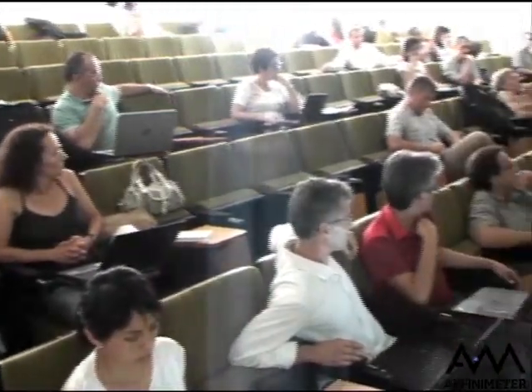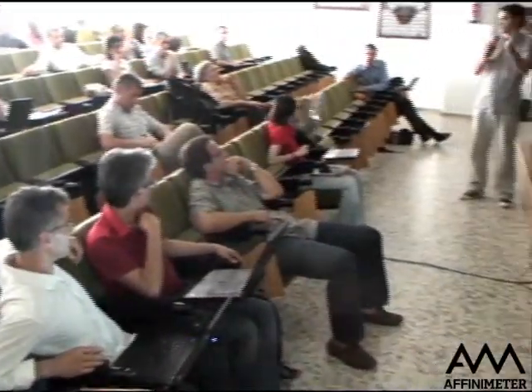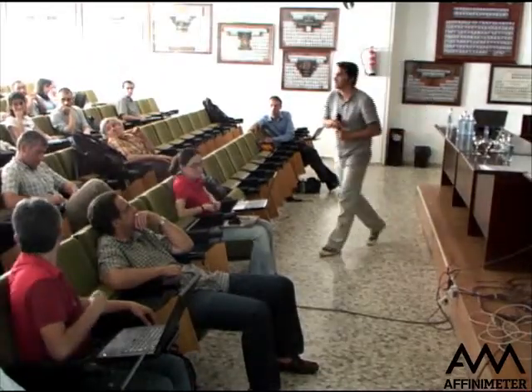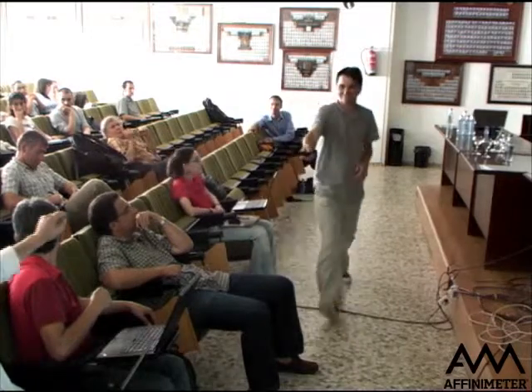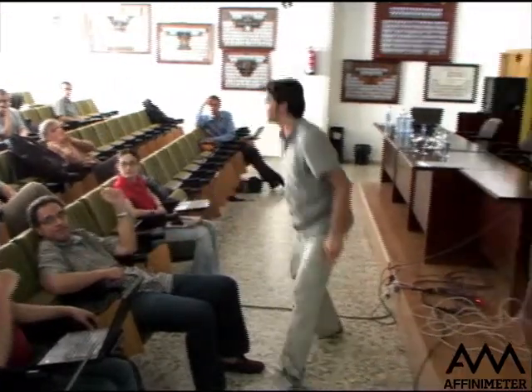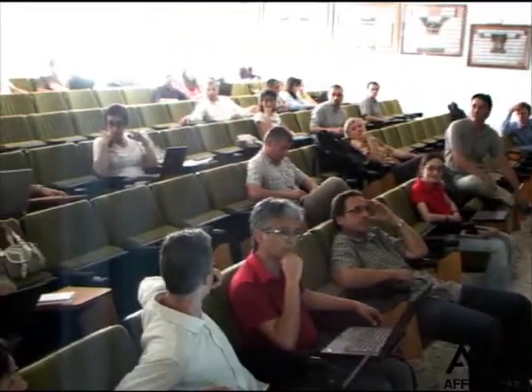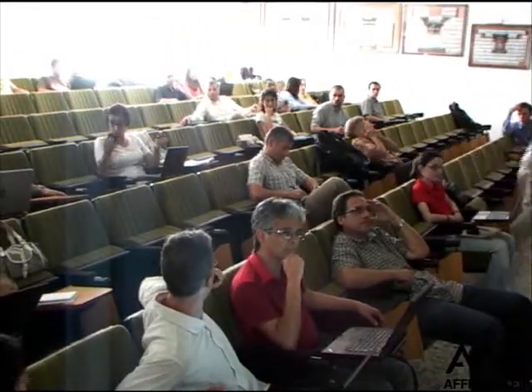But all of these are equilibrium reactions, so it doesn't matter. It's a way of making a definition. But all the association constants in AFFINimeter correspond to the creation of more complex species. All of them. If you want the dissociation constants, you have to take the opposite. Yes. That was my question. Exactly. And all the arrows are bidirectional, so all are equilibrium.